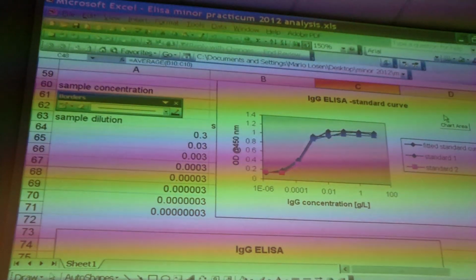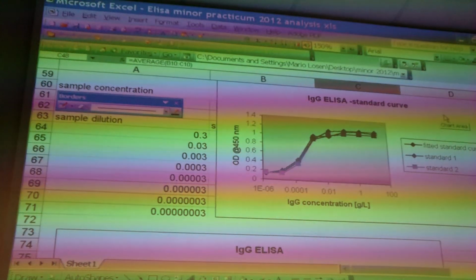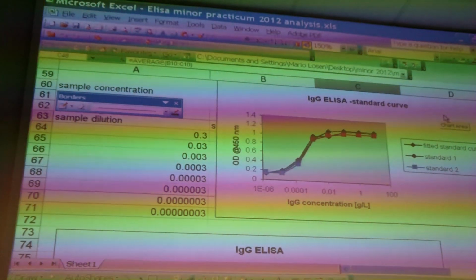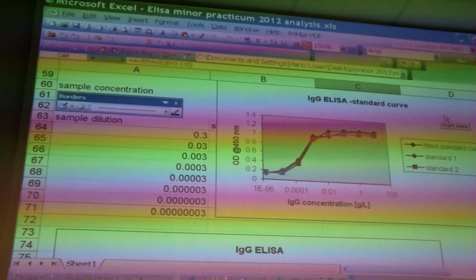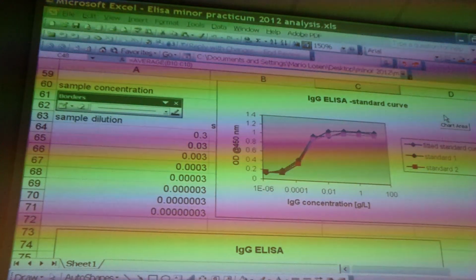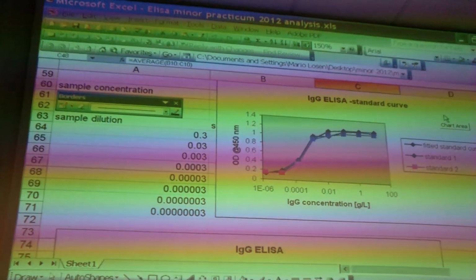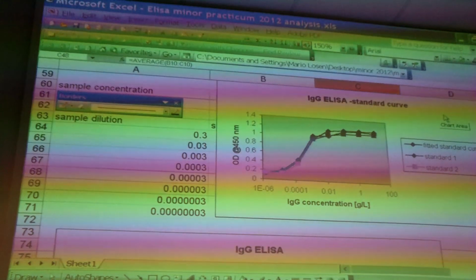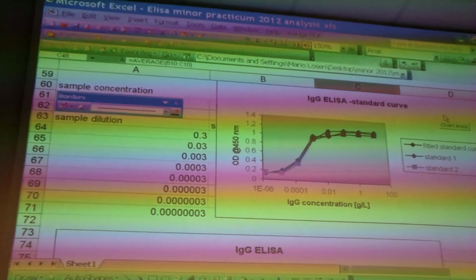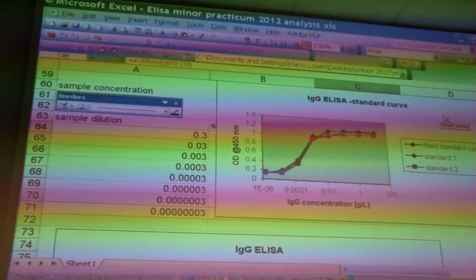The medium has an absorption too. Now the medium is gone. The medium is all washed away except for the antibodies. But what gives some absorption? The plate itself. Actually, that's what happened here. And you might have some background from the unspecific binding that we just discussed. Maybe you don't get rid of it completely, so maybe the secondary binds a bit to the surface.